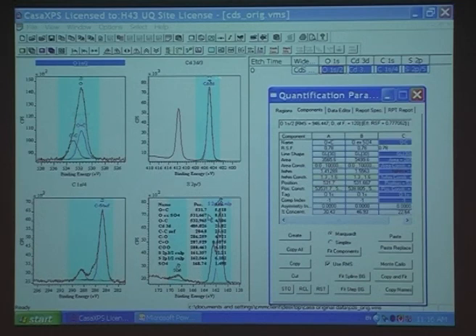Because the carbon's confusing me. There's a lot of carbon oxygens. It'd be better if they weren't there. So the cleaner your samples, the better. Okay? As I said, oxygen's a difficult one early. But it's coming out not too bad.